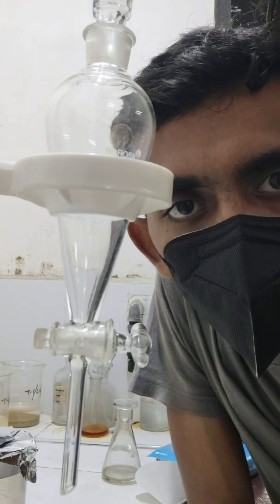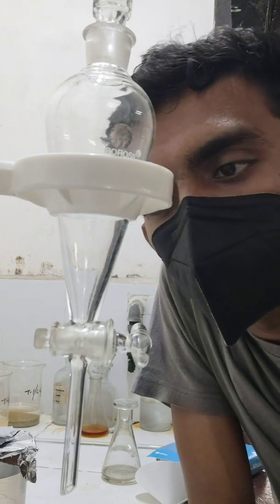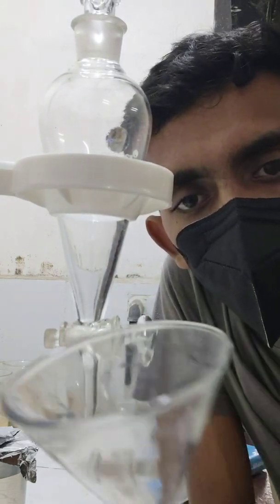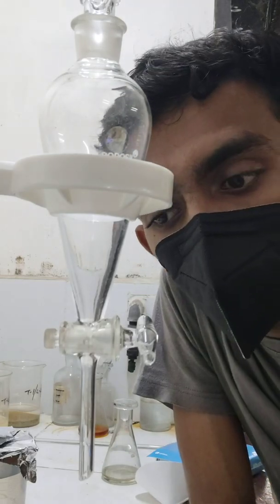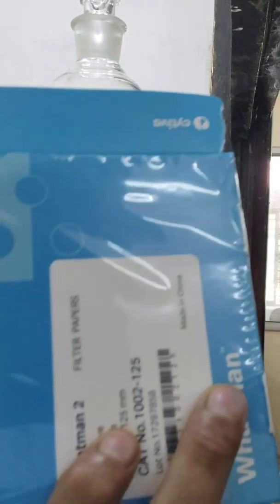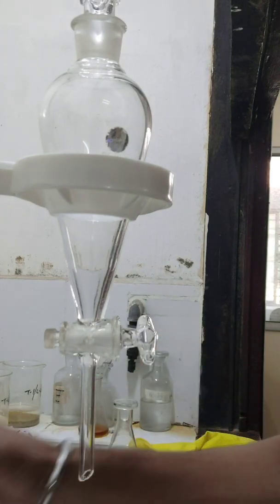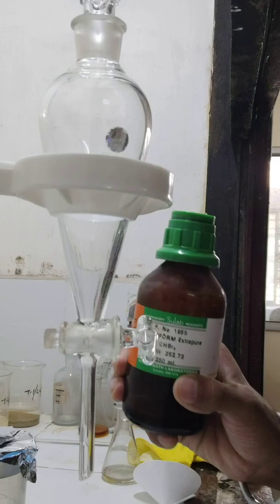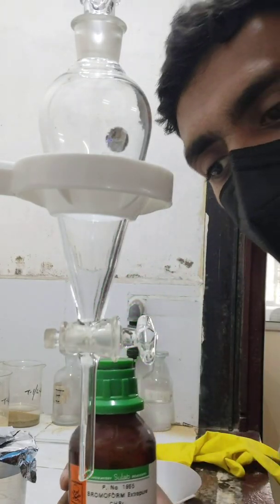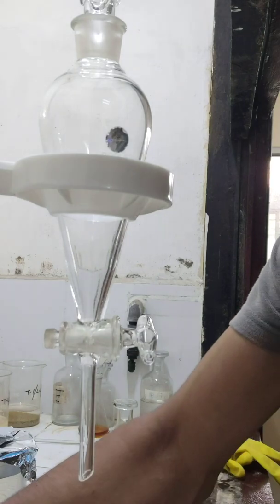Hello everyone, today we are performing the bromoform test. That test will require the apparatus: the separatory funnel, then funnel stand, then one more funnel and filter paper — that is your Whatman 2 filter paper — then the essential chemical that is the bromoform, and then pure acetone for washing purpose, and few clips to clamp the filter paper.